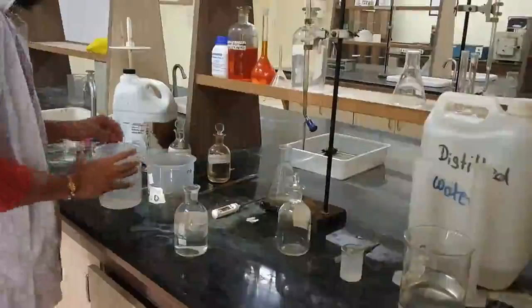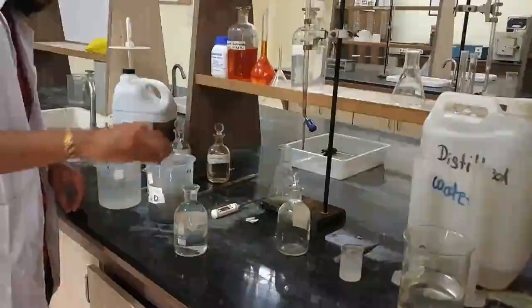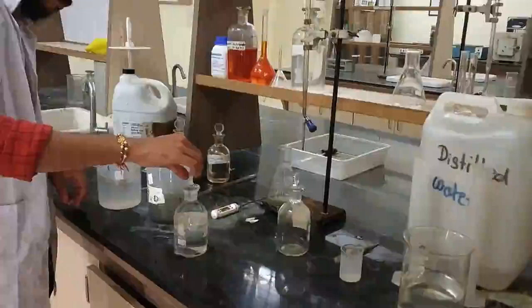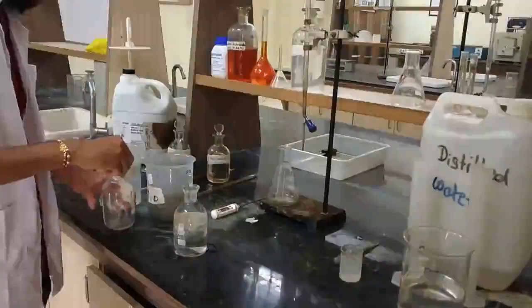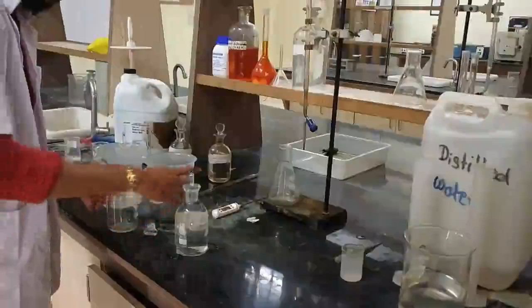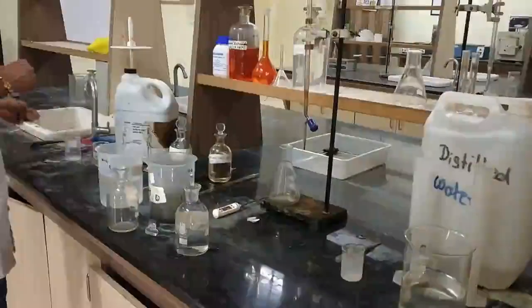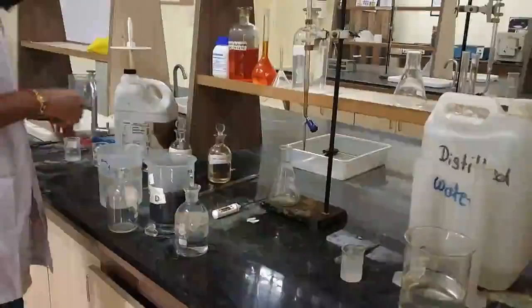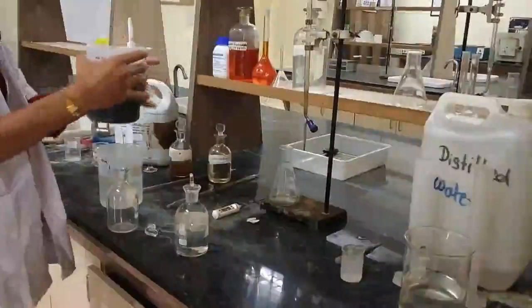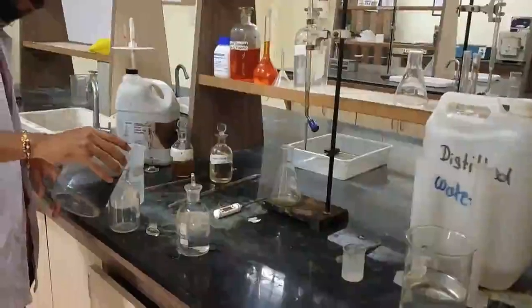We are going to stopper that bottle. The excess water sample will flow out. It's okay. Next BOD bottle, and we are going to fill it with the help of the blackish sample. We'll have to stir it properly so that a uniform sample is getting filled in the bottle.